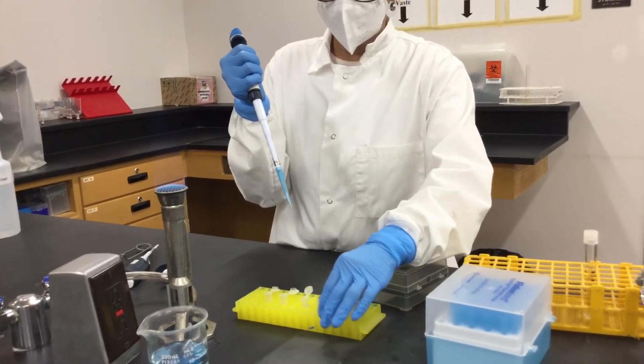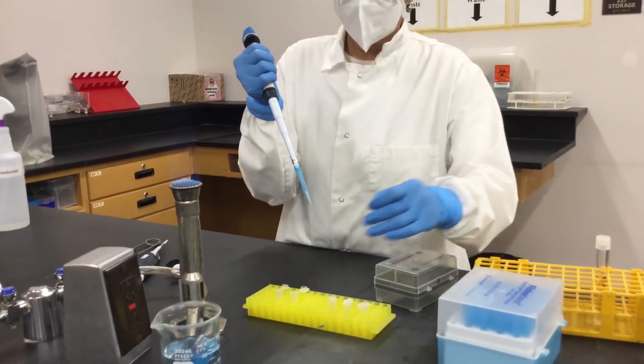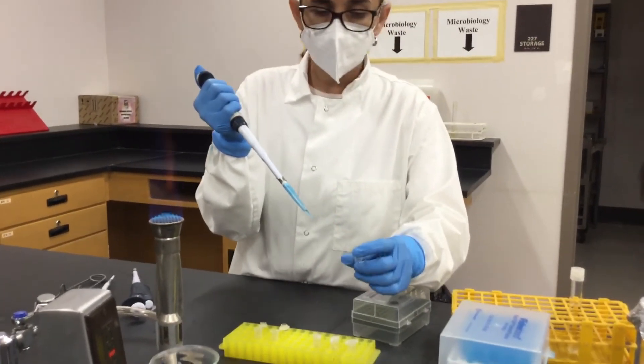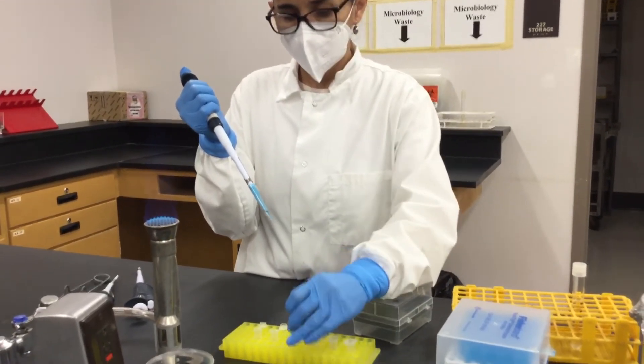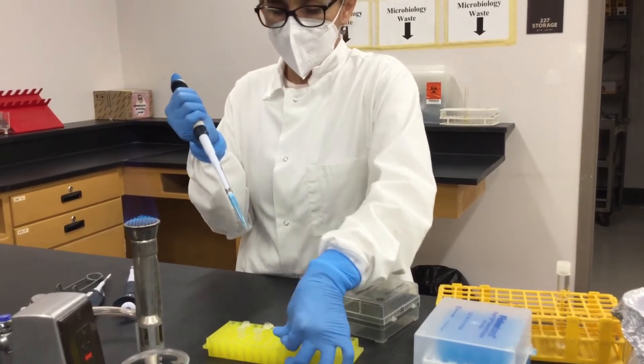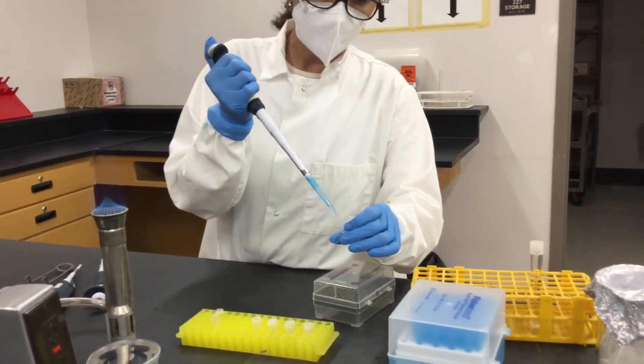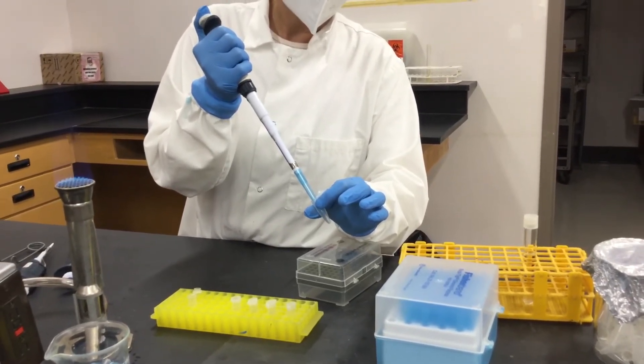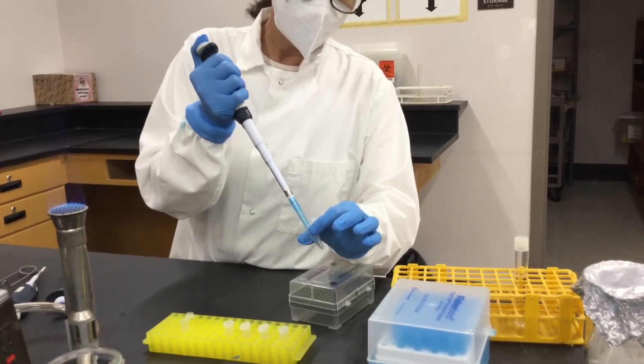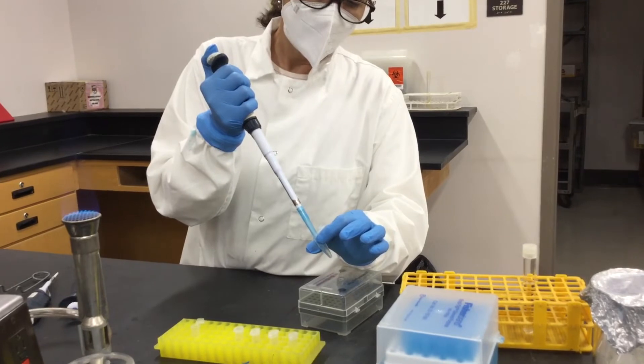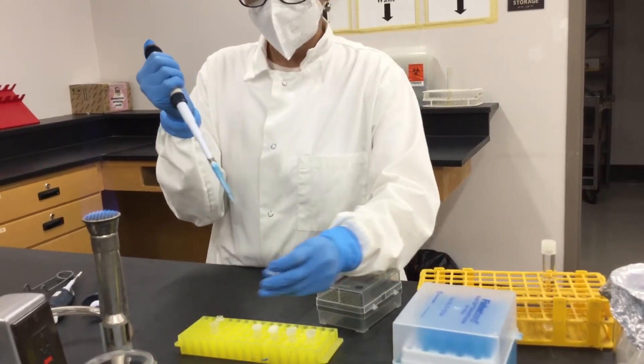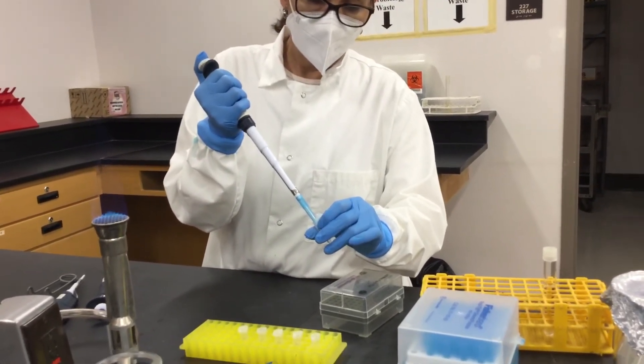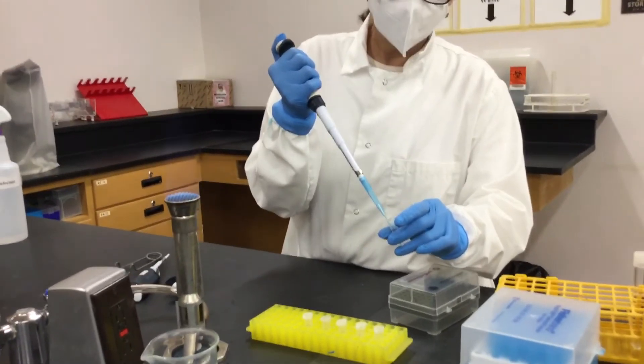And then close this. You can change the tip, but in this case we are going to use the same. Grab 100 microliters of this, close it, and then add it into your next tube which is having 900 microliters of sterile water. Mix it really well, punching up and down, and then grab 100 microliters, close it, add it into here, and then you end up in the 10 to the minus 7 dilution.